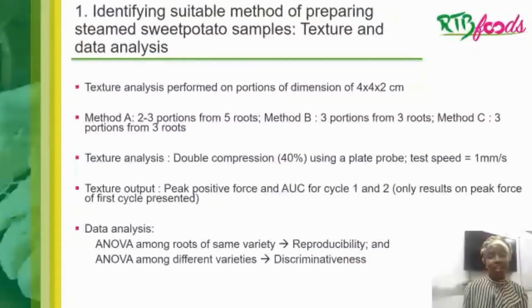On this slide, we try to give more details in regards to the texture analysis and data analysis. I would like to bring your attention to how we went about the data analysis. We looked out for two things, the first being reproducibility. And here we were wondering, are we able to group roots of the same variety together?